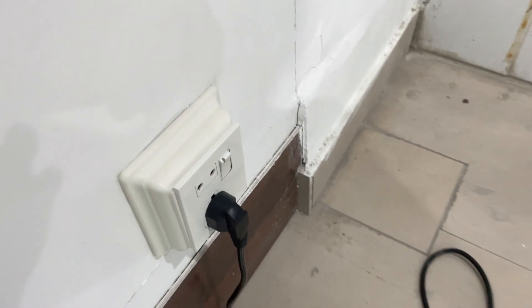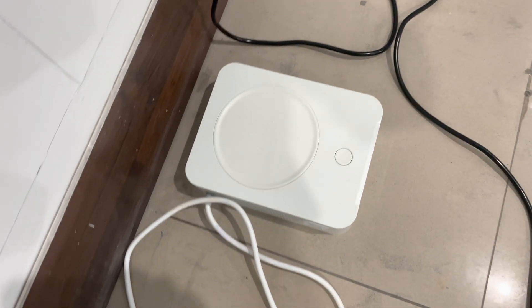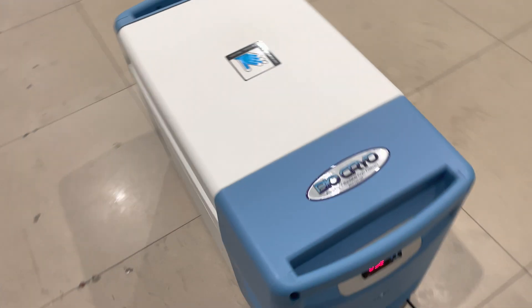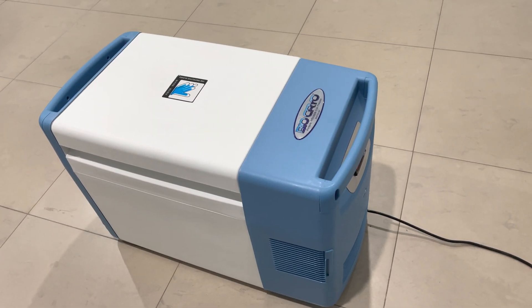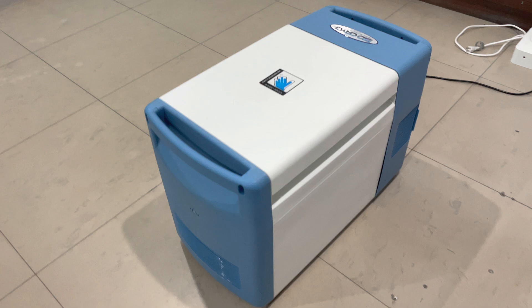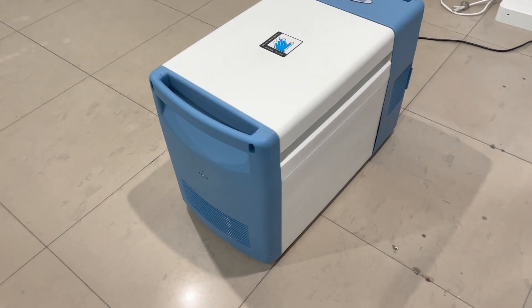It does come at 220 volts, but we include a converter with every freezer so you can use it easily at 110 — no problem. You could also plug it into a car adapter, which is great for travel. It has two handles so it's easy to move around, and it holds hundreds of vaccine vials, tissue allograft, research samples, or pharmaceuticals.